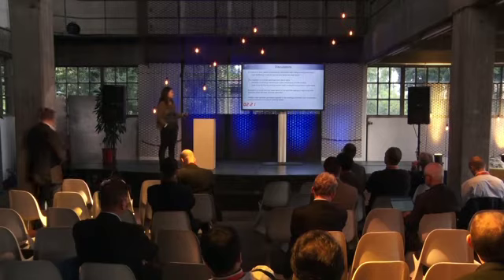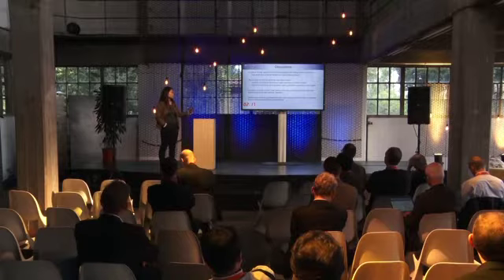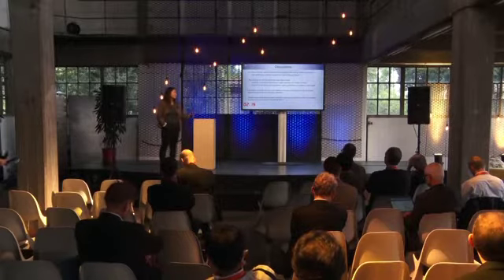I just want to discuss a few points here. We found that the formation of wear debris is predominantly associated with rolling contact mechanics, because we found a high concentration of chunk, lamella, and sphere debris. We also see the evolution of the iron-rich sphere particles, from the dendritic morphology with or without hollow internal structure to a very smooth surface.